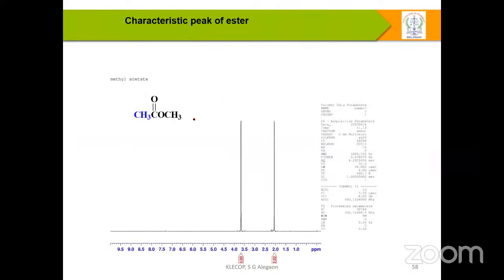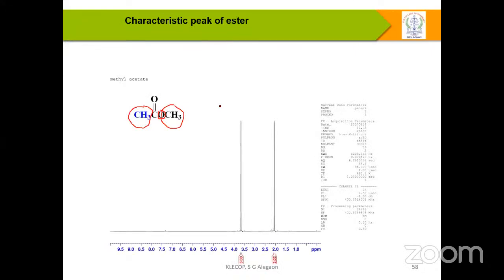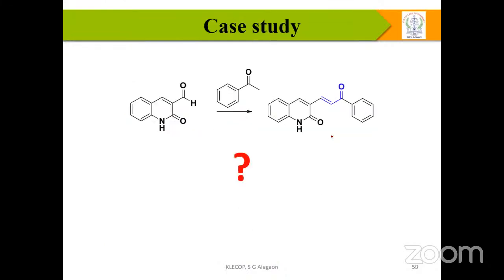And then coming to ester. In the same way, in acetone we have got only 1 peak, and in ester we are going to get 2 peaks. And these CH3 terminal peaks, the blue and the black, where are we going to observe them? Both are attached to carbon, but this CH3 proton is attached to the oxygen of the ester. So that's what you get very near to 3, whereas the methyl protons you are going to get in this segment.